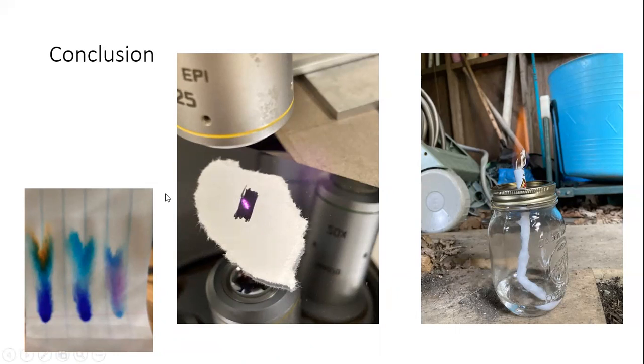You can enjoy the wonderful pictures here. This was one of my first results from chromatography from home. Looks terrible. This is our broken spectroscope. It is supposed to be a dot, but it is a line, unfortunately. And this is just a picture of a homemade heat device. Works pretty well and looks pretty cool.